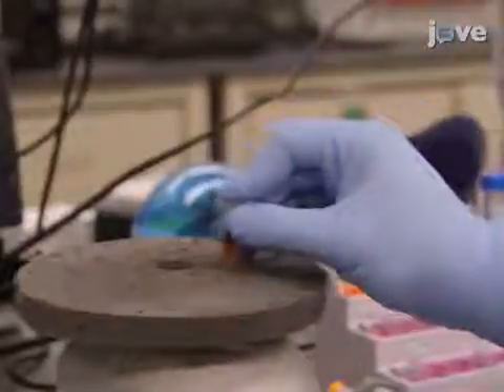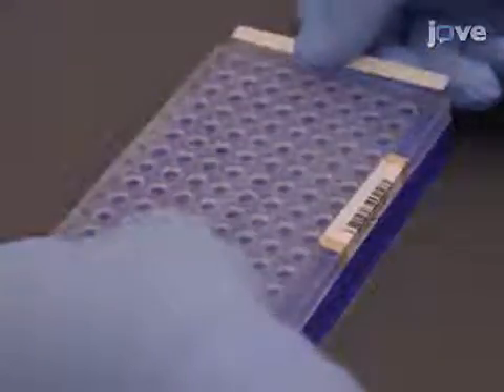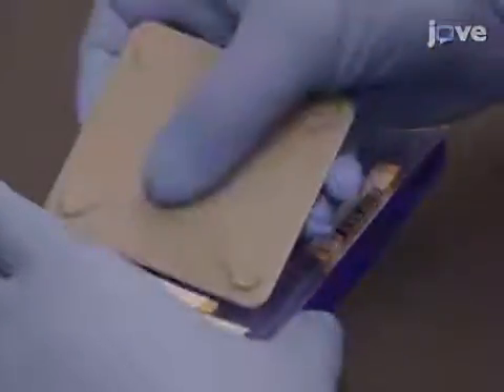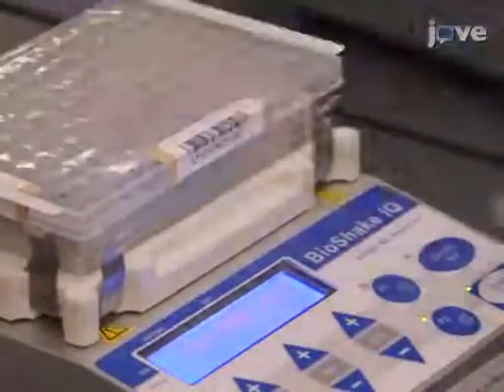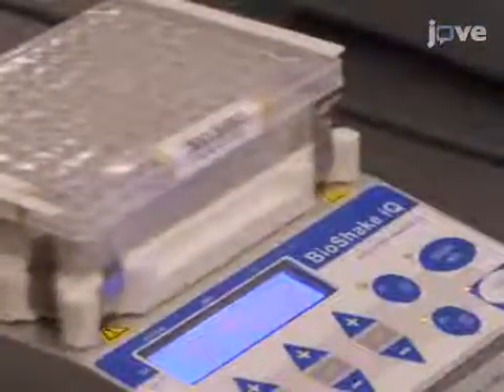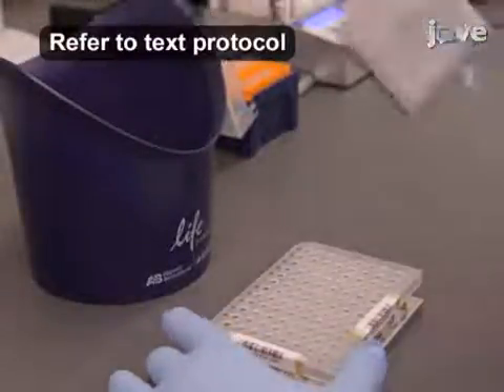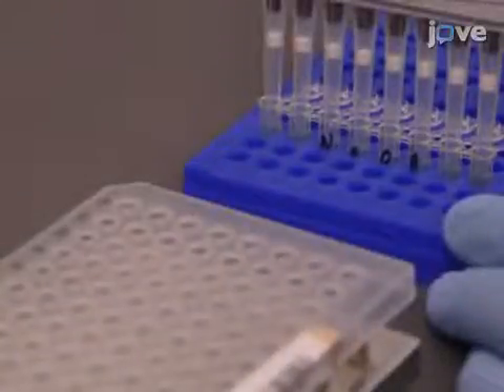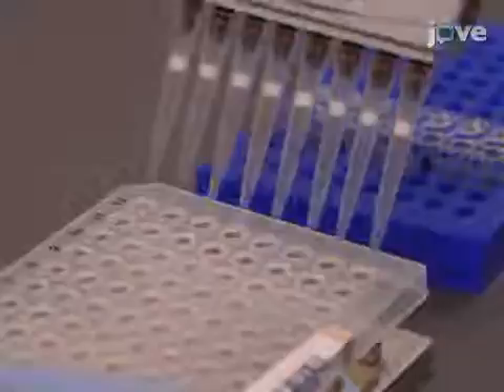Following the preparation of the normalization mix with intermittent inversion and vortexing of the solution, add 45 microliters to each sample of the LNP. Then use clear adhesive film to seal the plate and shake at 1800 RPM for 30 minutes. After washing the beads, remove the LNP from the magnetic stand and to elute the sample, add 30 microliters of fresh 0.1 normal sodium hydroxide to each well.